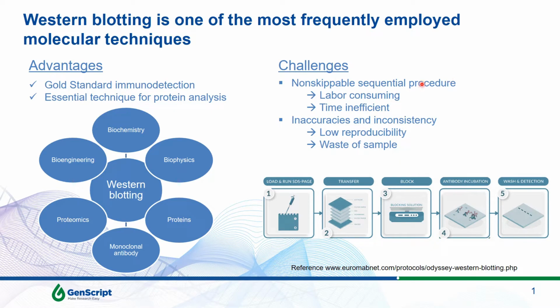However, a couple of challenges faced by many researchers out there in the field include its non-skippable sequential procedure, from loading and running samples, transferring to membranes, blocking, antibody incubation, and multiple washes. This is the universal procedure, which takes hours to days, that is labor-consuming and time inefficient.